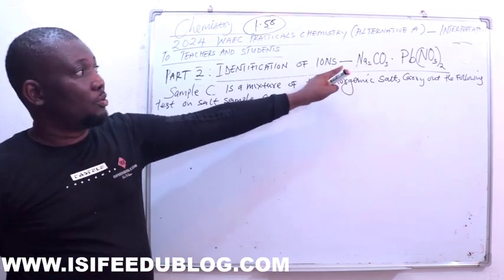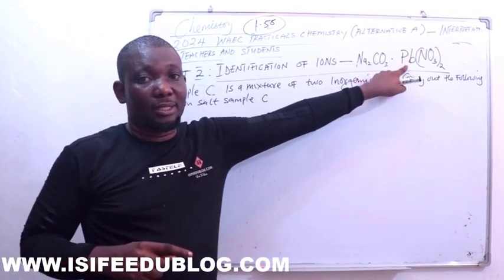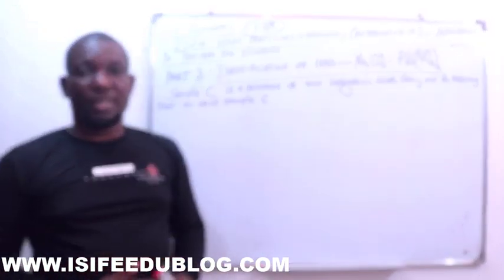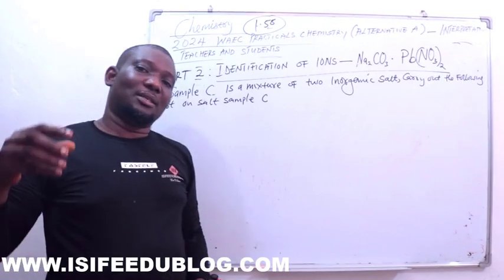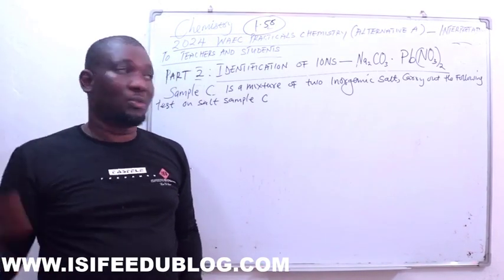Being that these are not transition metal salts, as well as lead, you should expect that the color of these two salts is going to be white. White describes the absence of transition metal salts, so the salts are not colored.